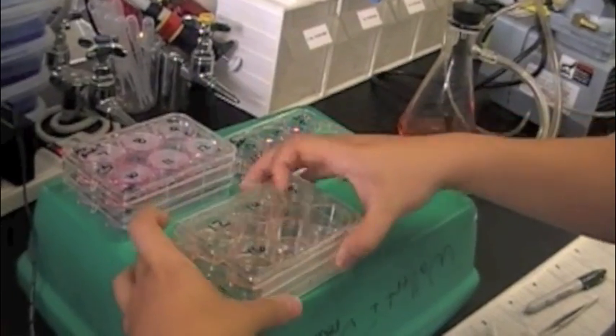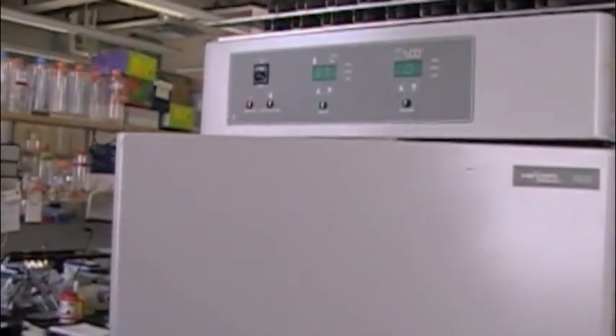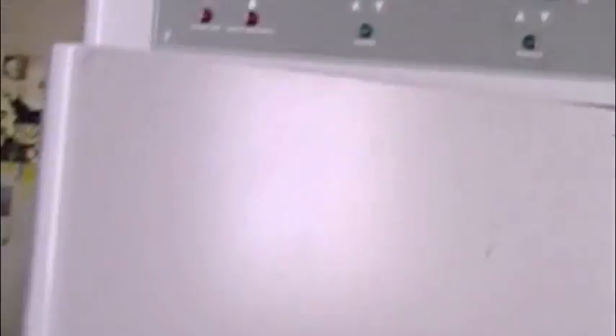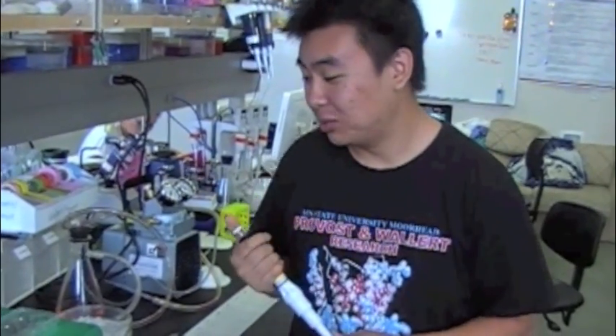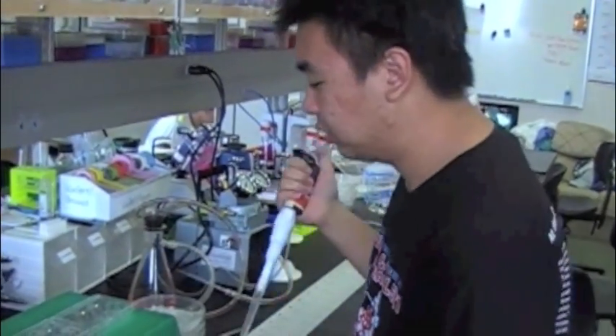Once you have your cover slips in the new plates, take the plates and place them in the incubator at about 37 degrees with 5% CO2 atmosphere. Leave them in there for precisely 20 minutes. After the 20-minute incubation, take the plates out and place them on an insulated surface so the plates don't cool down.